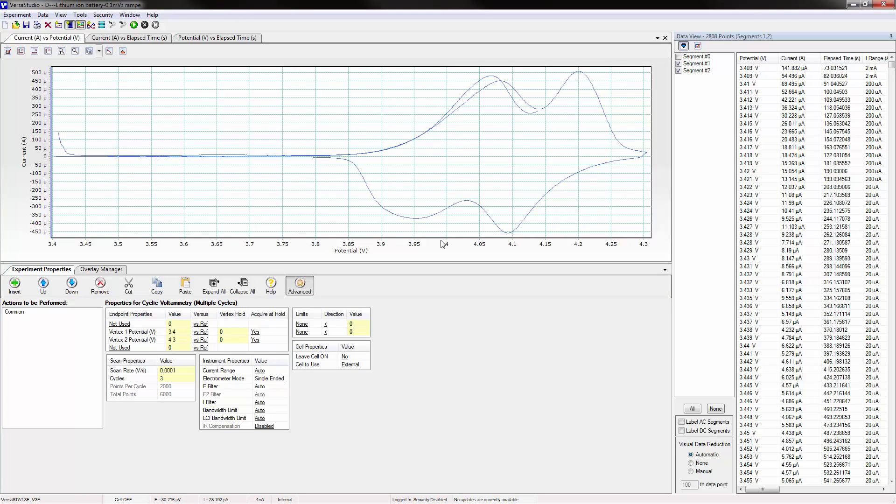VersaStudio's new window docking layout lets the user view both live and saved data in whichever format best suits their individual needs.